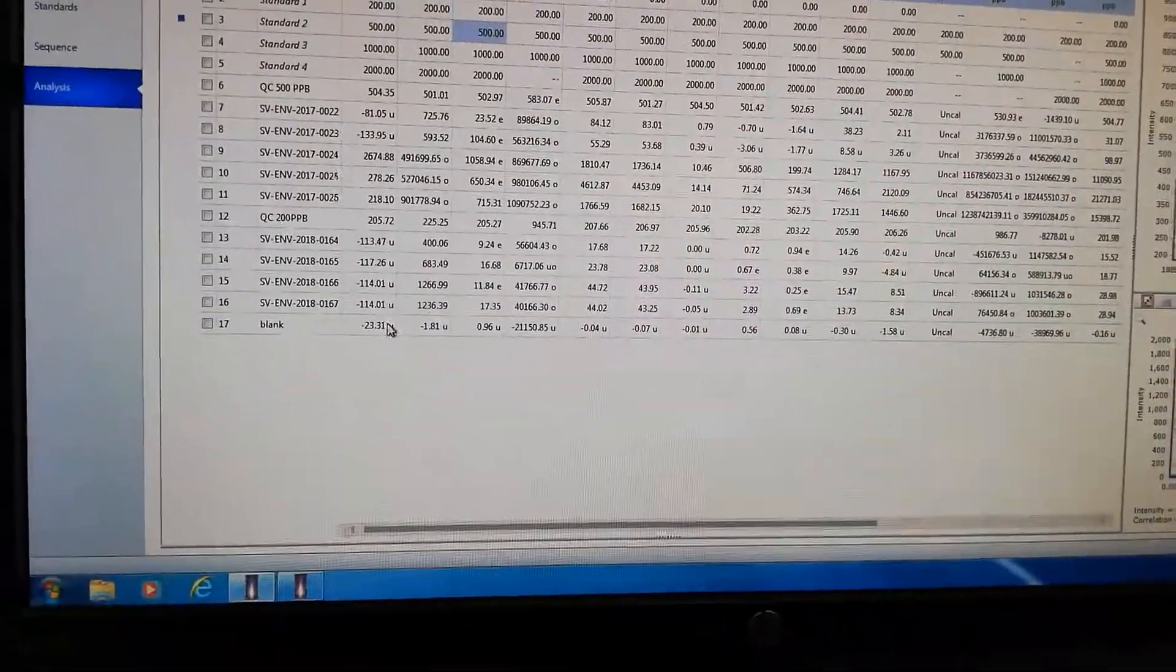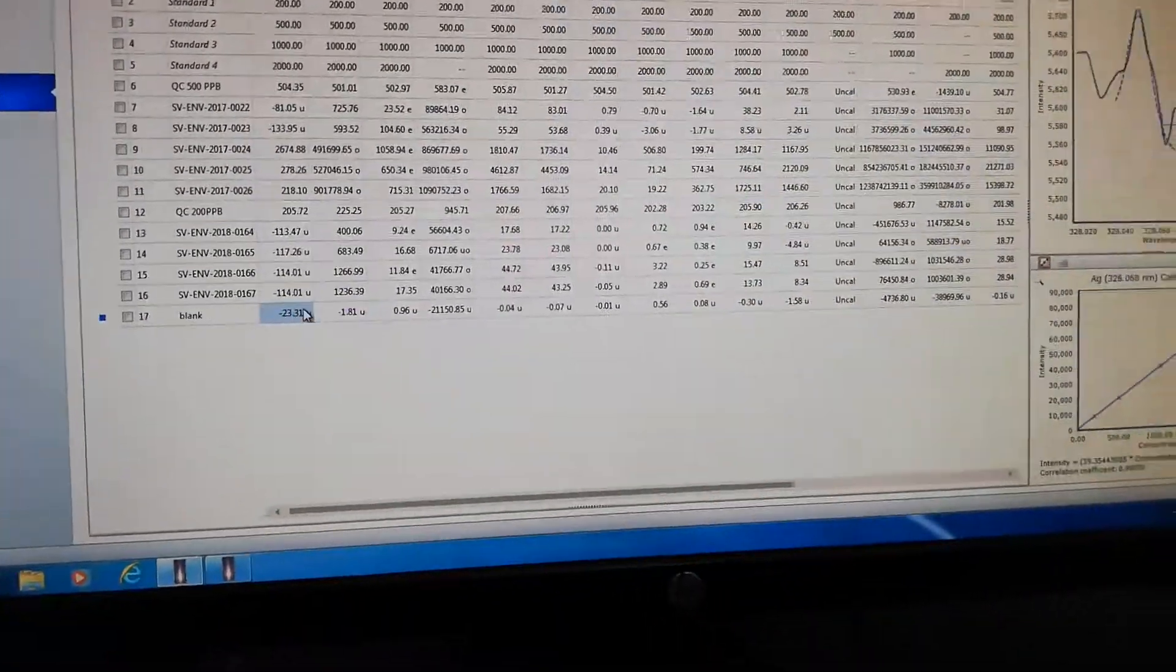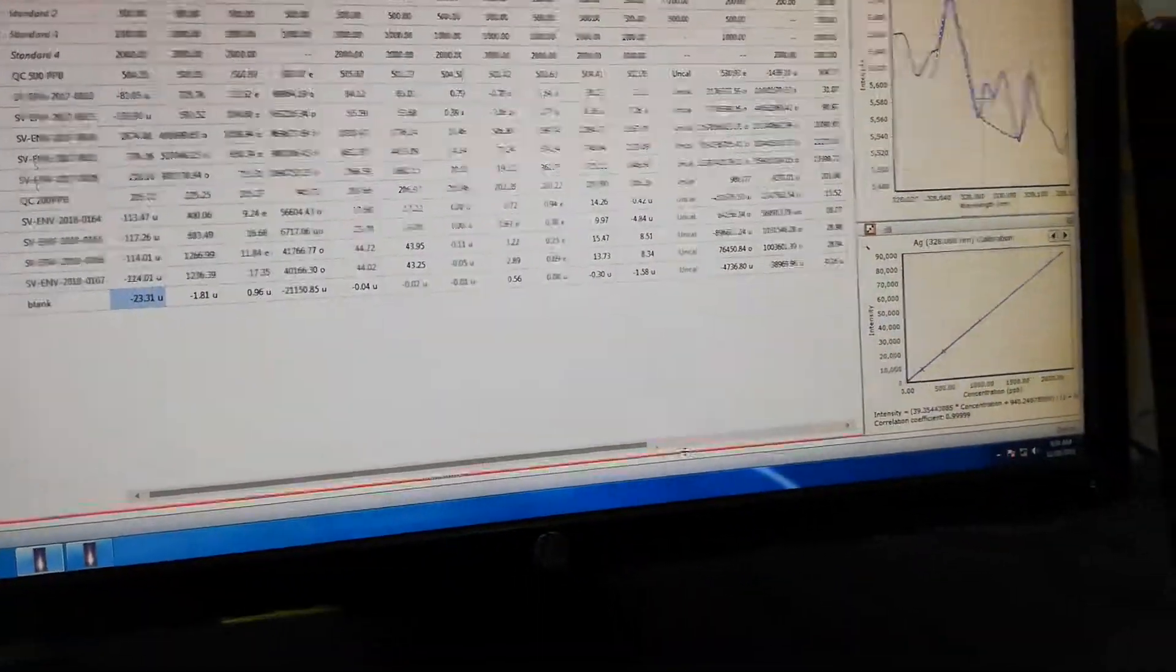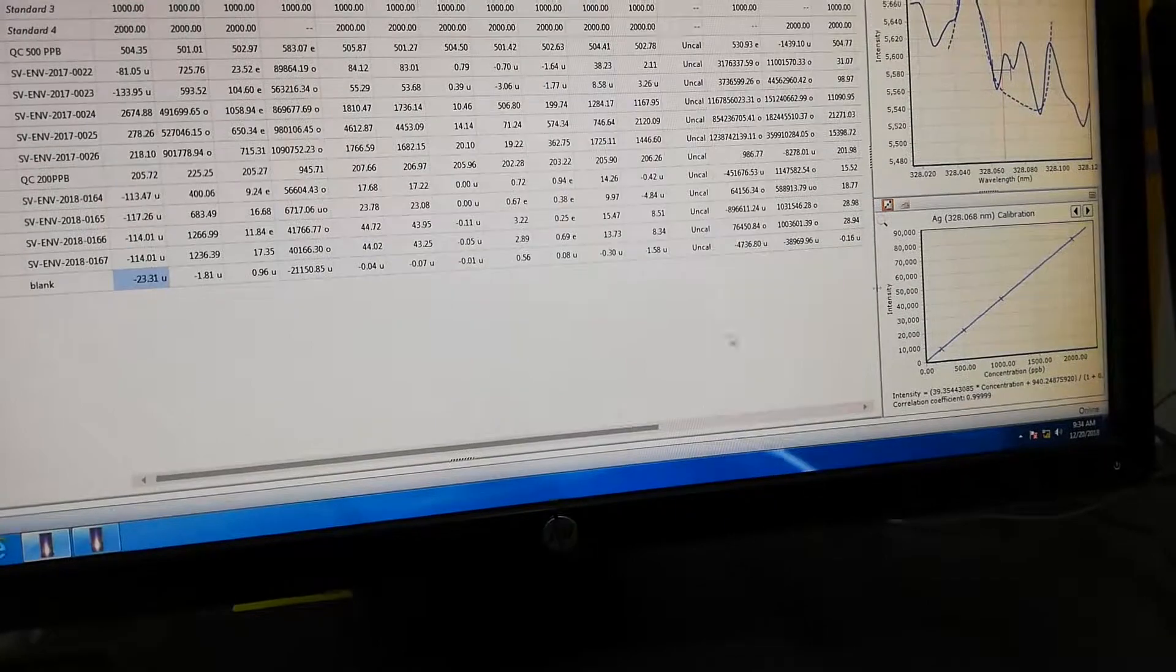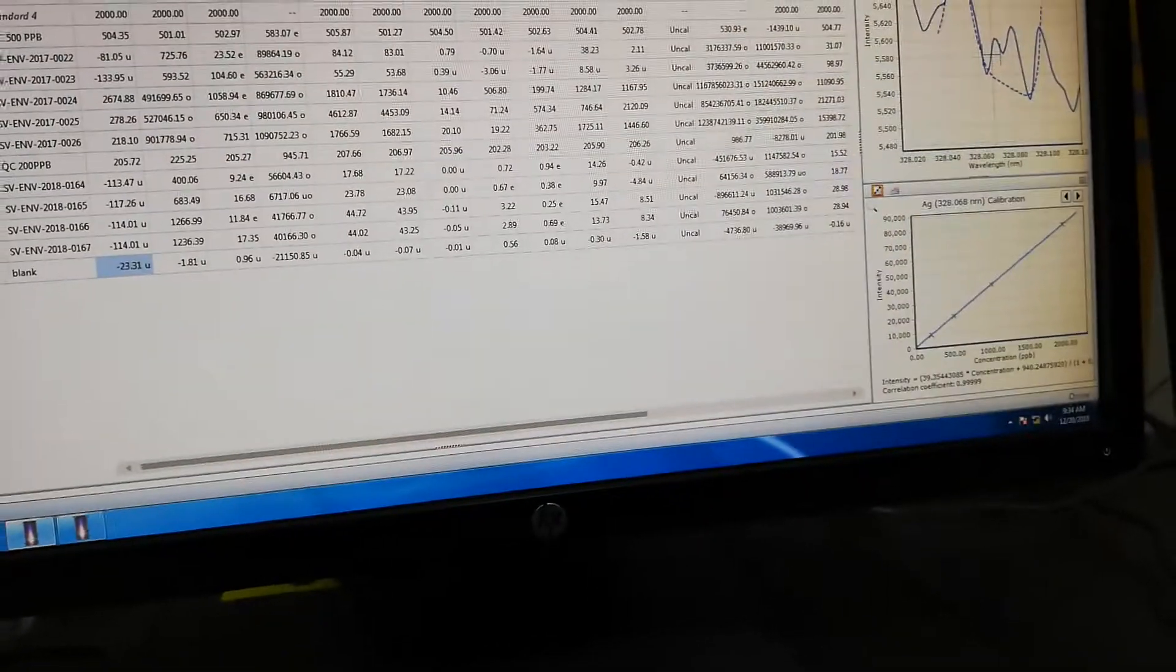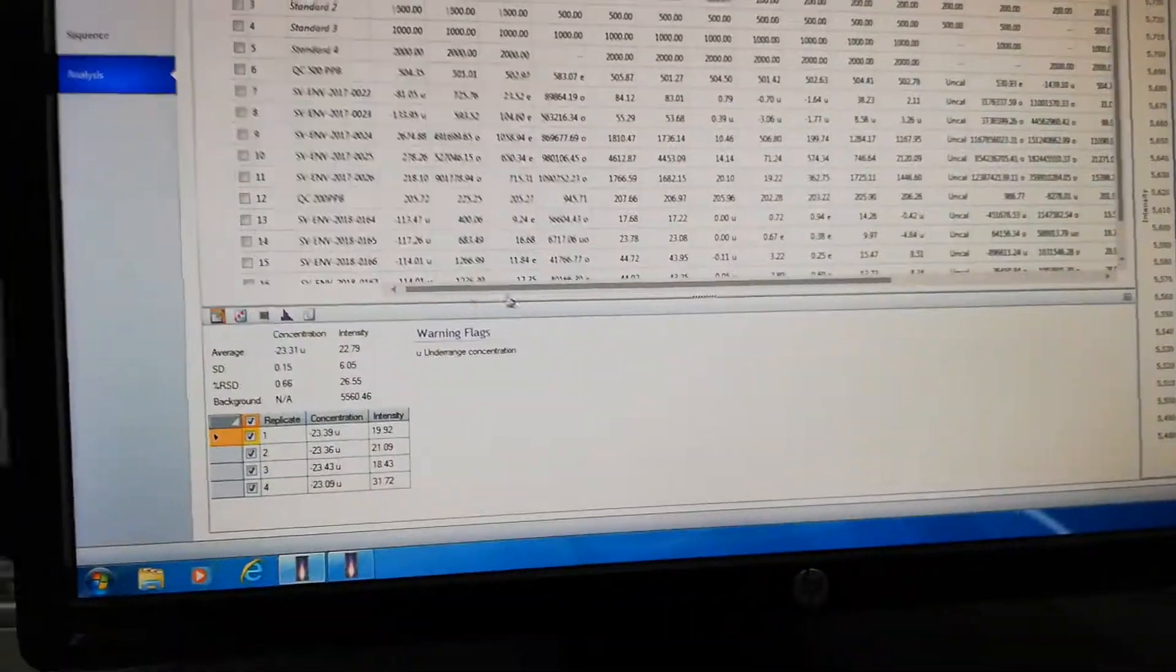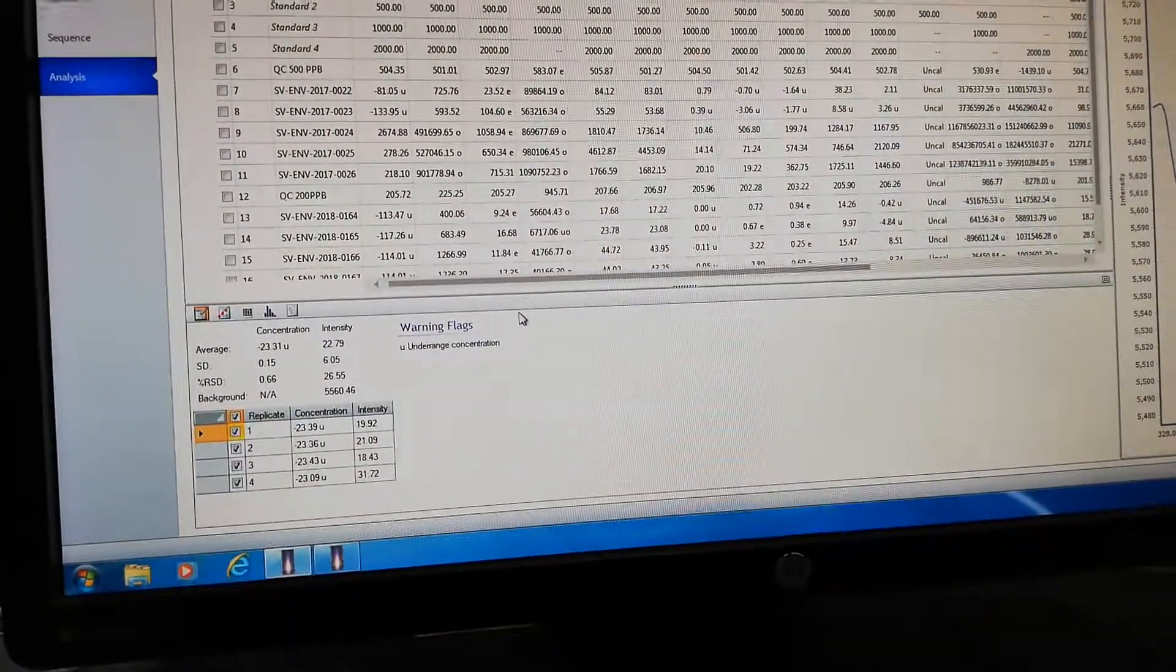Now for our analysis of the finish. Here is a different metal.